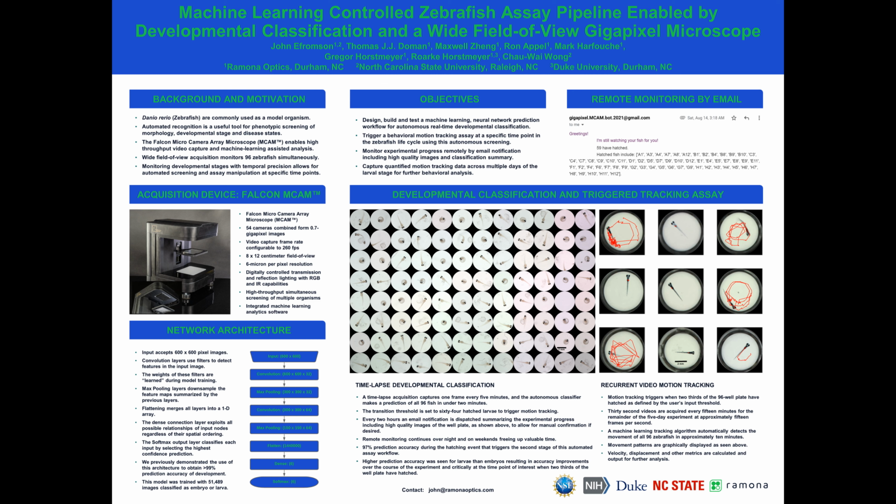The model used in this experiment was trained with over 51,000 labeled images of embryos and larvae and yields approximately 97% prediction accuracy. When a user-defined threshold of hatched fish is reached, the next stage of our assay is triggered, which activates recurring video acquisitions and accompanying behavioral assays, yielding quantitative behavioral data. Additionally, the user is notified by email at defined checkpoints with high-resolution images, and the transition to time-lapse video acquisition can be initiated remotely.